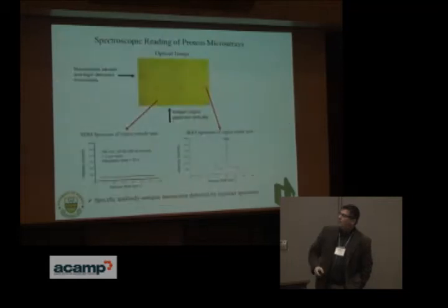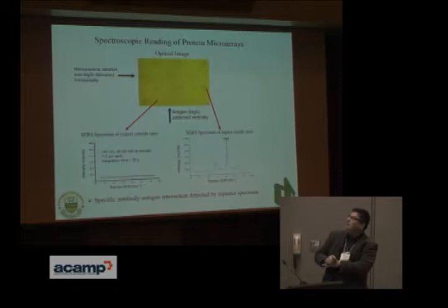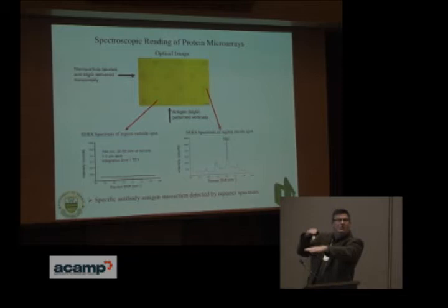Okay, so how do we do our reading? We take our chip that we prepared, and so we've patterned our proteins, we've delivered our nanoparticles through these microfluidic devices. You can see these squares. We've used very high concentrations of everything so that you don't really need Raman spectroscopy to know that there's an interaction here. But the proteins are on the surface, and then we run the nanoparticles orthogonal to that. And so where the lines intersect, we get interactions.